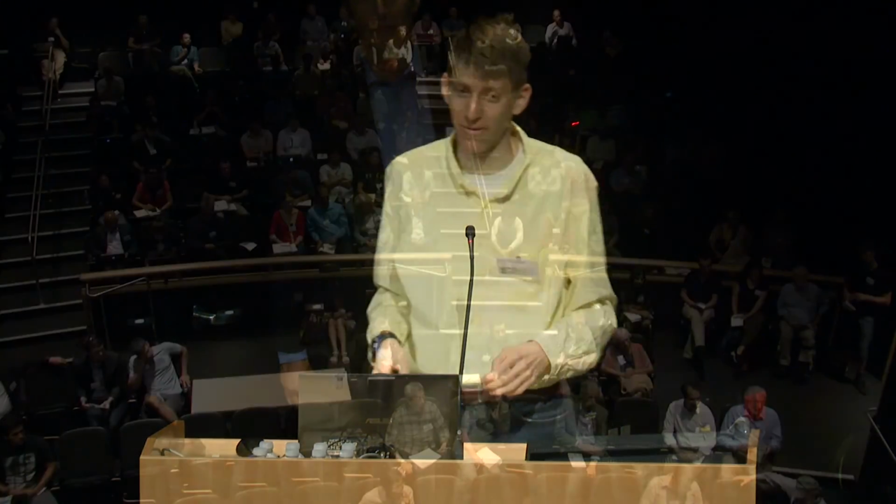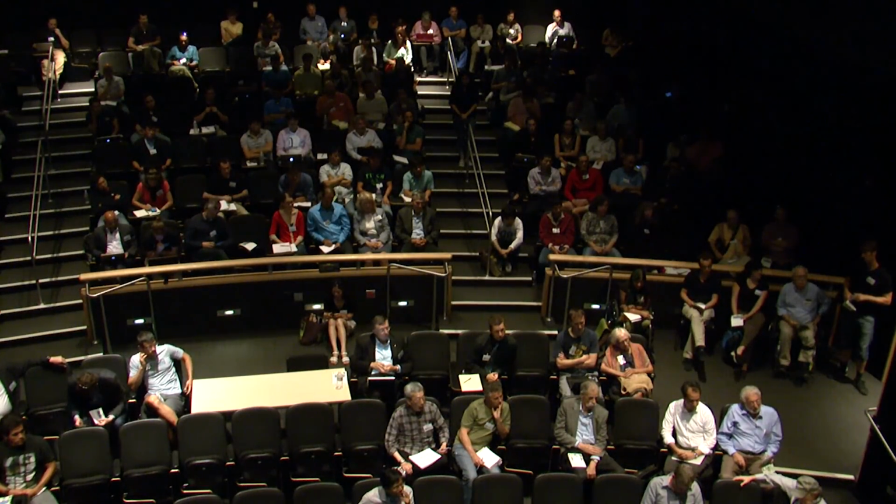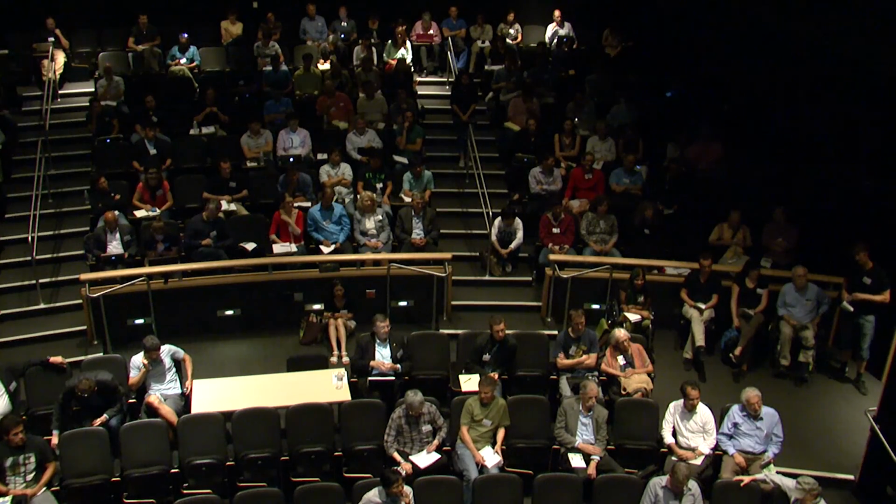Hi. With the use of high-power lasers, do you see any temperature changes? Great question. So you might have noticed that the laser power we were using for those wide field images was 3 watts of laser power, which is a lot of laser, right? But don't freak out. It's spread over a very big area. And the reason we do this is that to get high intensity over a large area takes a lot of laser power. And most of that light does go through.